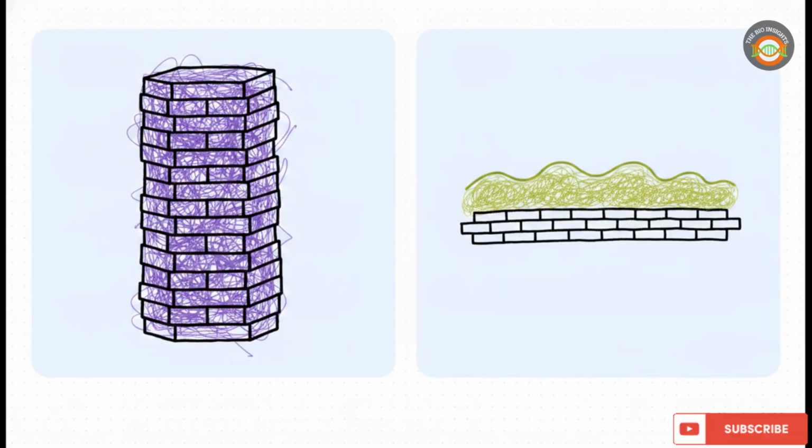So, what does this actually mean for the bacteria? Well, the gram-positive wall acts like a thick, rigid brick wall. It is incredibly robust, measuring roughly 25 to 30 nanometers thick. And actually, this is exactly why it traps that purple dye so well. Gram-negative bacteria, however, have a wall only 10 to 15 nanometers thick.